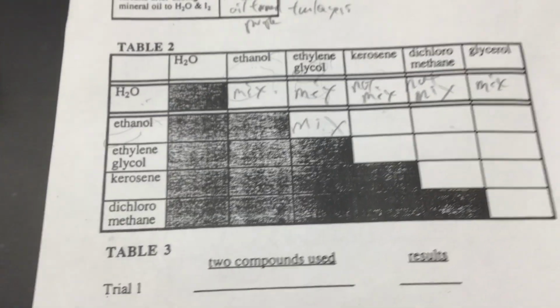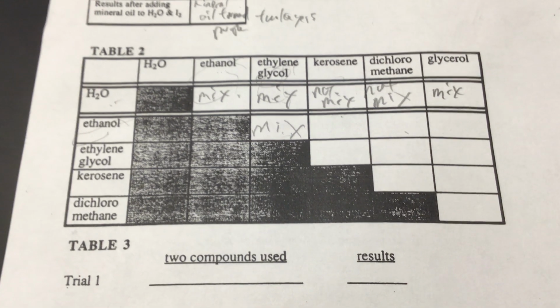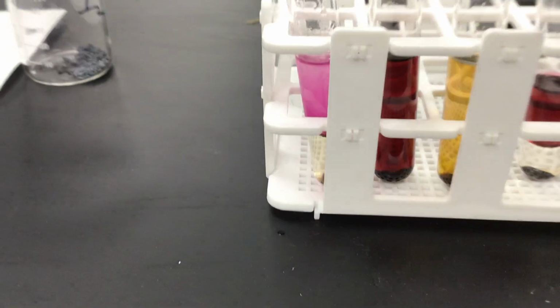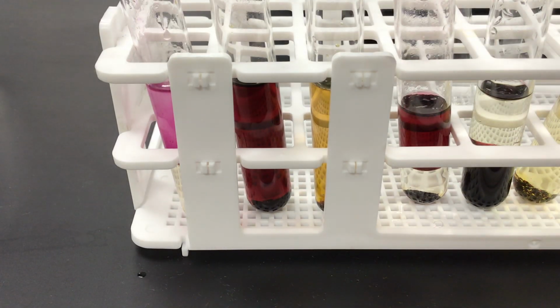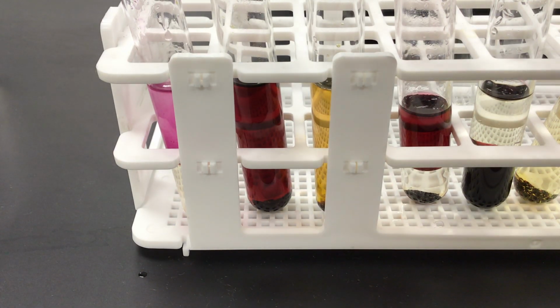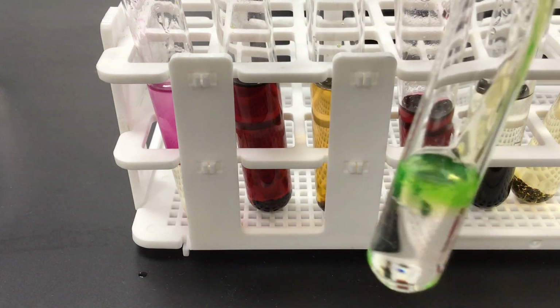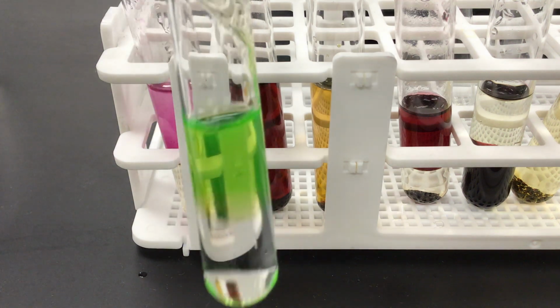So let's mix ethylene glycol and dichloromethane together and see what happens. Based on our predictions, we should get 2 layers. So there's the dichloromethane. Here's the ethylene glycol. And sure enough, our prediction is right.